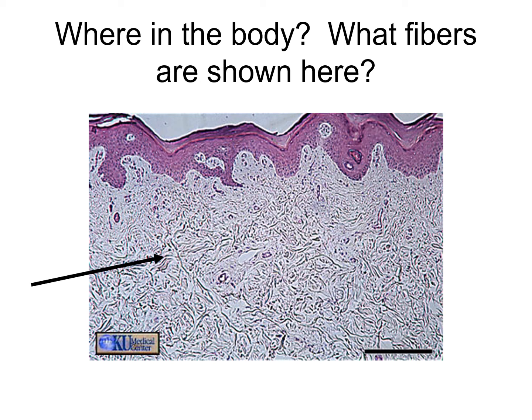The skin? It is skin. Specifically, the arrow is pointing to the dermis of the skin. But which layer of the dermis? The reticular? It is. And so what fibers do we find there? Reticular fibers. See, that's where it gets misleading. It's dense, irregular connective tissue, and it's predominantly collagen.